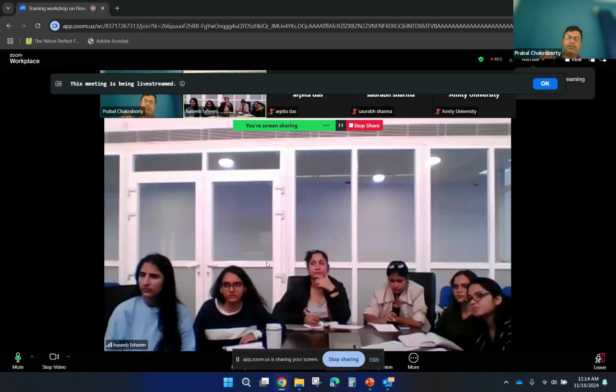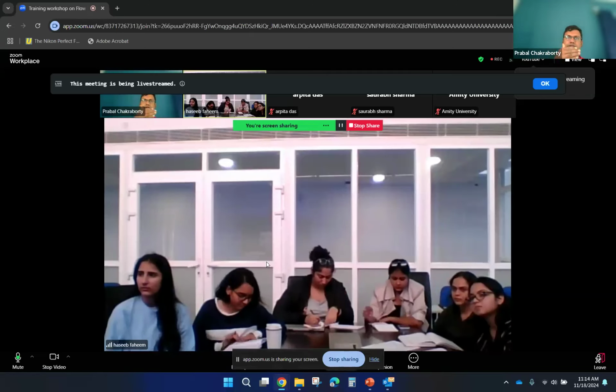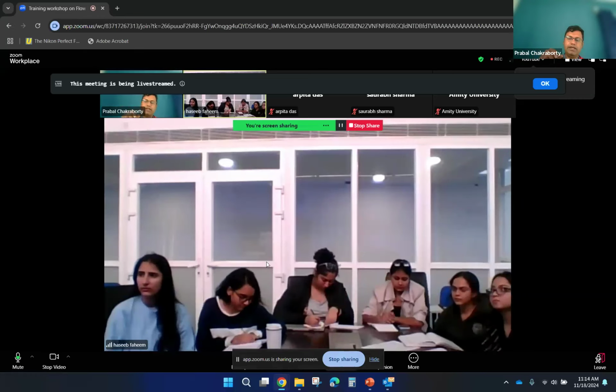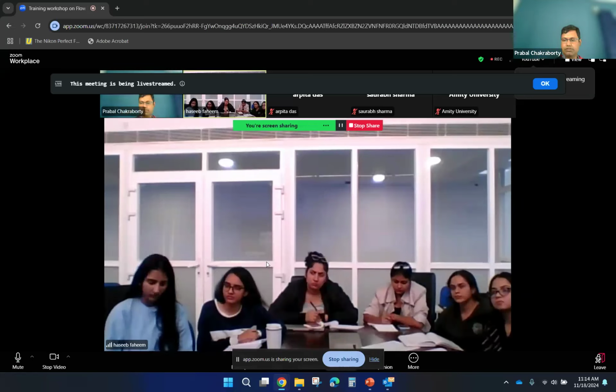Okay, so there is a fluorophore molecule called DAPI. DAPI probably you will use when you do the lab. DAPI actually goes inside the nucleus, the double-stranded DNA, and binds there. So when you stain or incubate your sample or cell with the DAPI, it will particularly stain the nucleus.